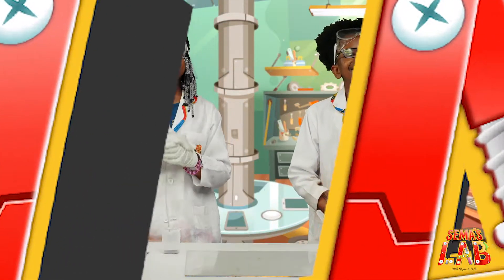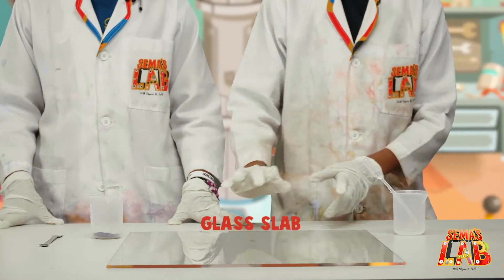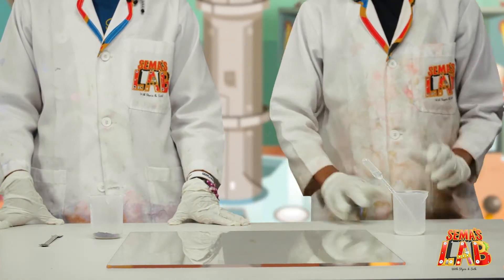Let's get started. The things that we need are potassium permanganate, glycerin, a spatula, and the glass slab slash tray.